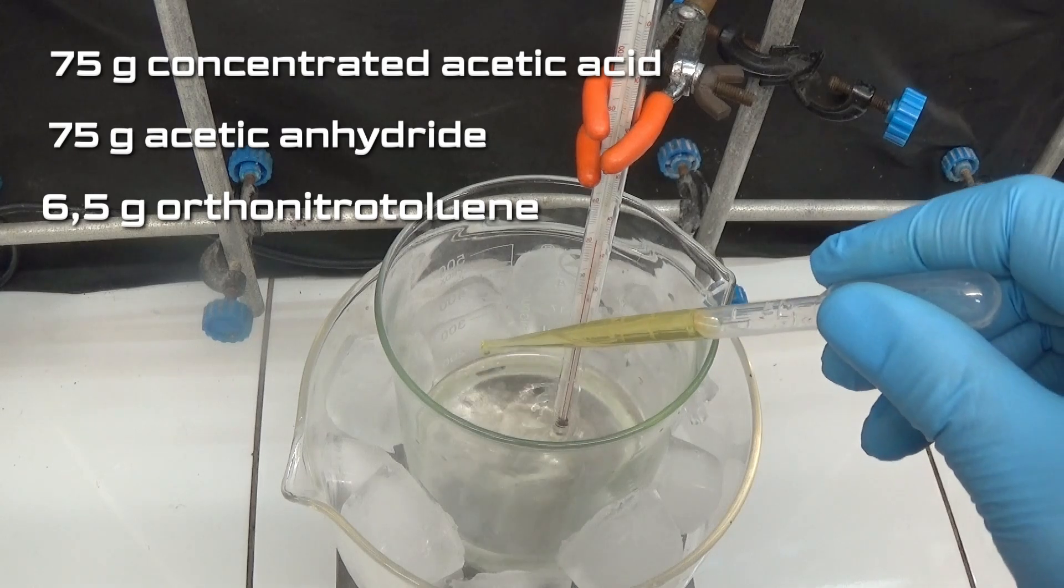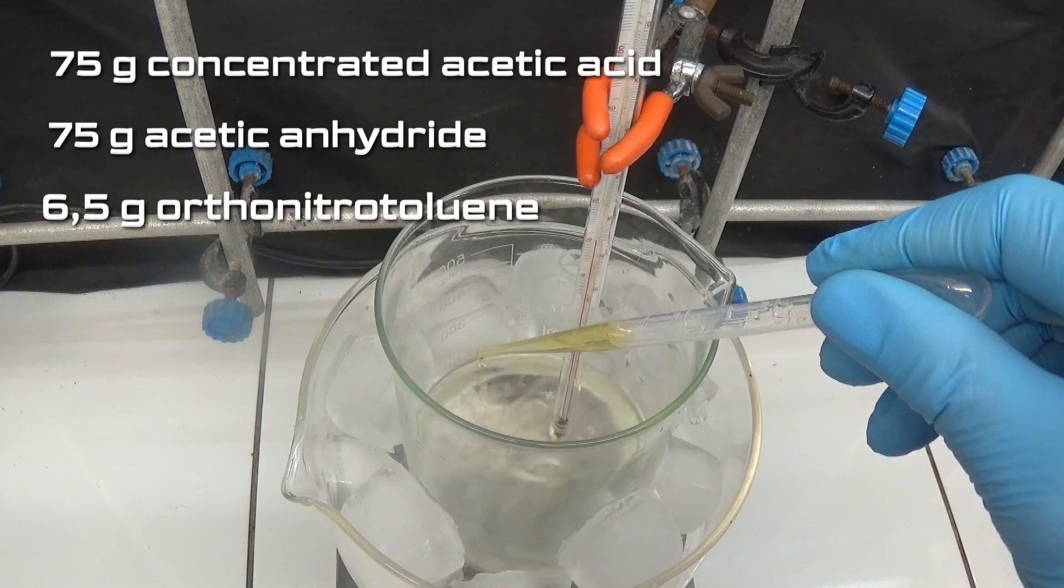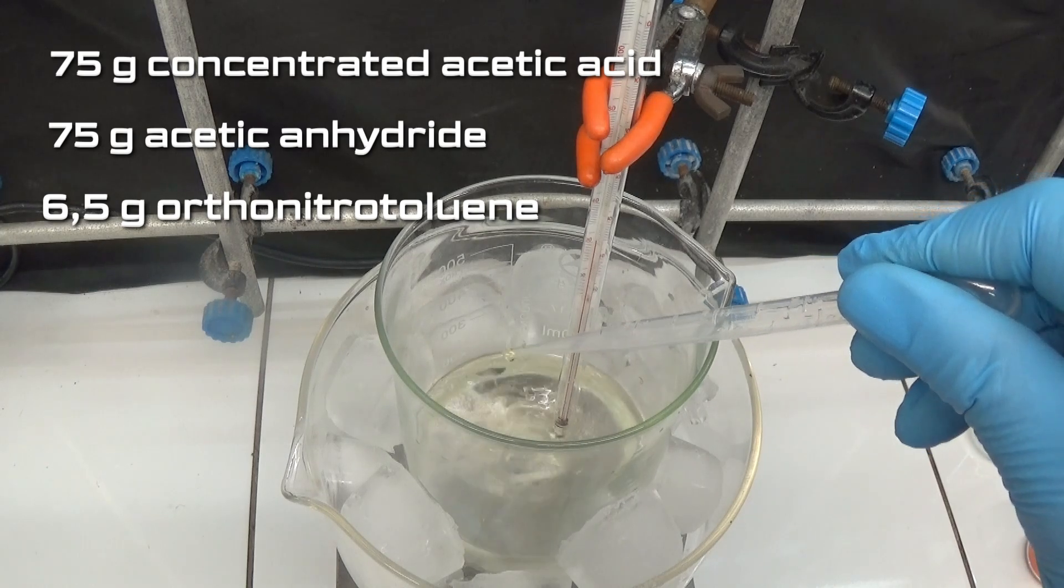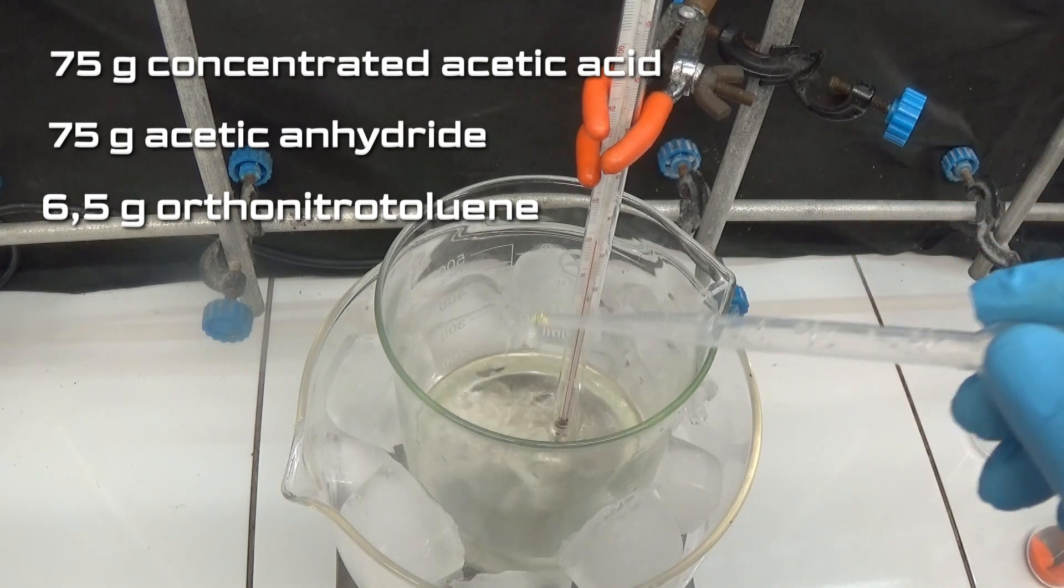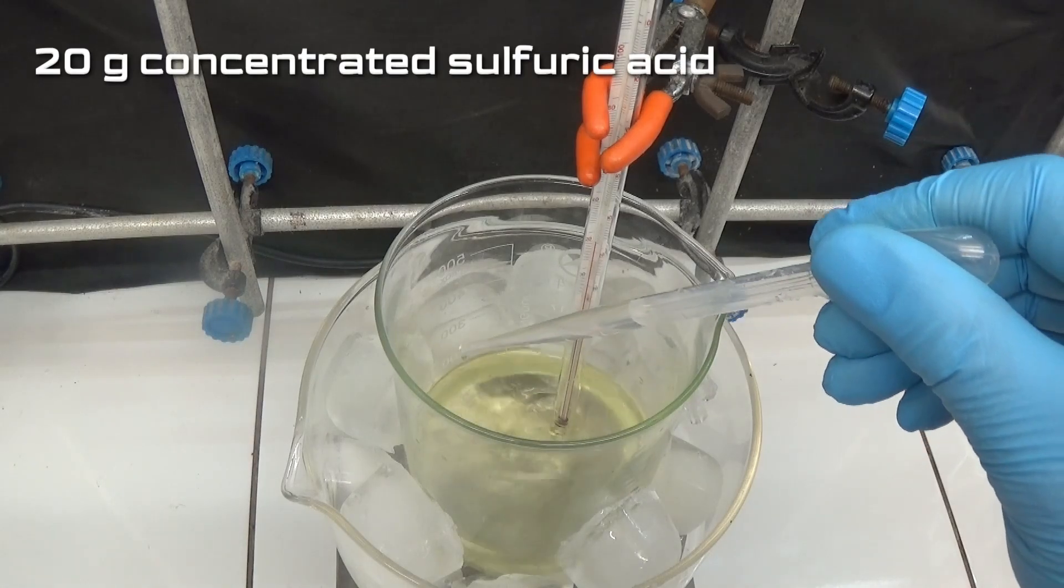6.5g of ortho-nitrotoluene. Add slowly 20g of concentrated sulfuric acid.